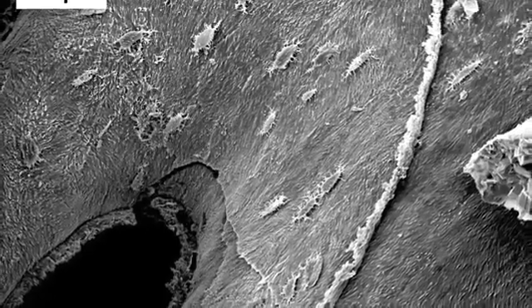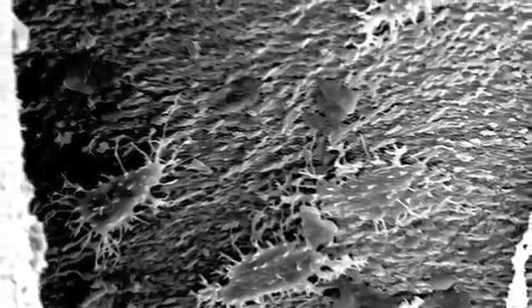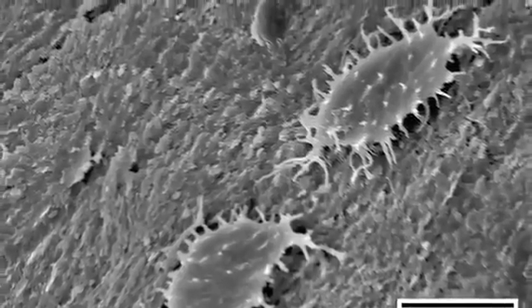Now I'll quickly show you some of these thin sections under the microscope — you can see the tiny osteocytes in them. Look at these pieces of tissue full of osteocytes: these are the little bone cells that maintain, manufacture, and produce bone. This is direct evidence of osteocytes in dinosaur bone collected from the Hell Creek Formation in Montana. Under the scanning electron microscope, here are individual osteocytes — look at the delicate filipodia, or little tendrils, coming off of them. These structures should not be there if the bones are 65 million years old.